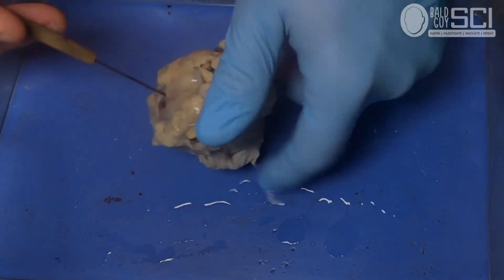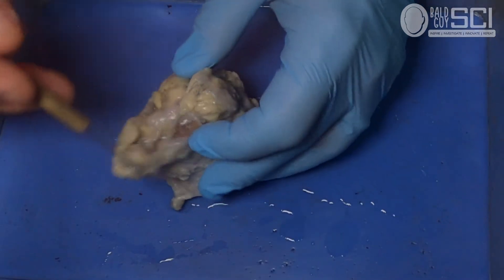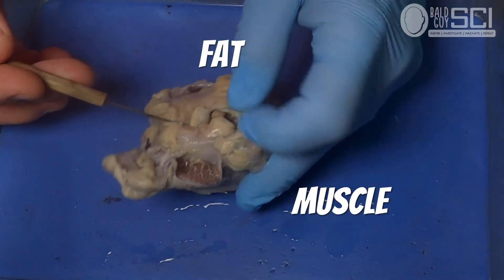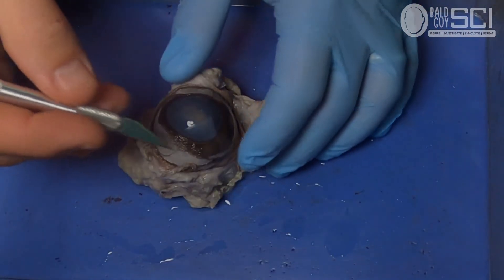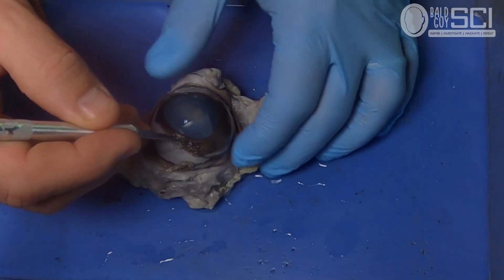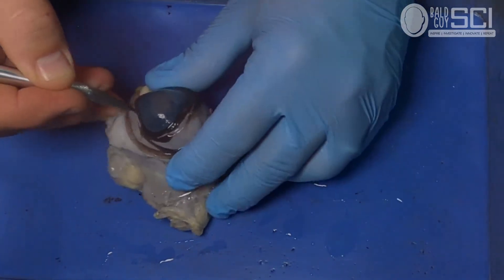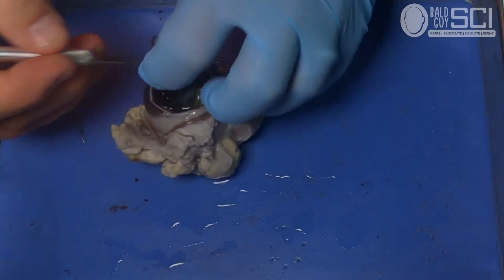Then as you flip the eye over, you should be able to find muscle, fat, and then the optic nerve, which you may or may not have to dig for. Now making the first incision, you're going to take a scalpel or razor blade and you're going to cut where the cornea and the sclera meet, and you're just going to remove it.